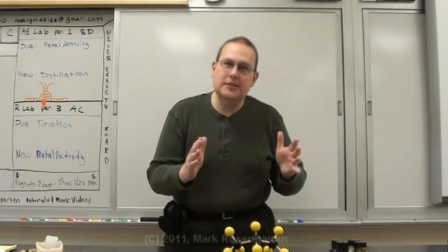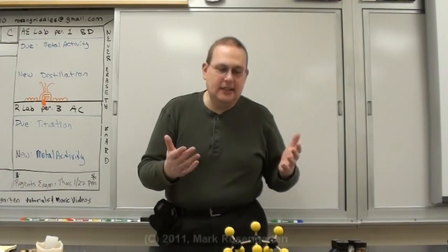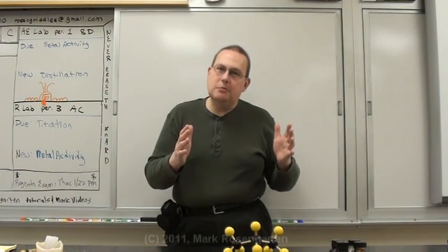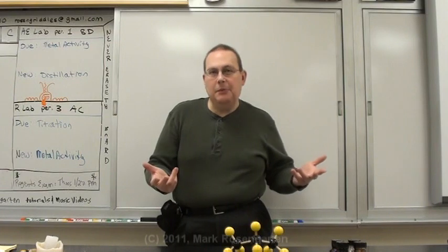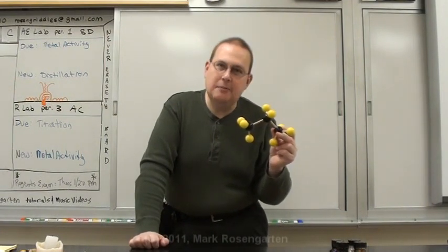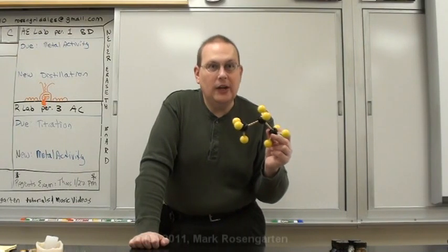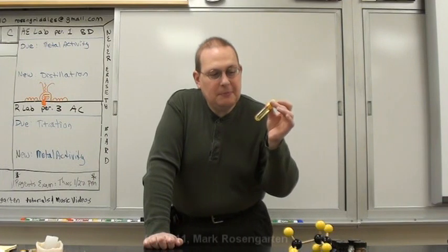The medium-sized ones that are used for such things as jet fuel, home heating oil, diesel, and gasoline, these molecules are going to boil at a much lower temperature, which means you've got to cool them off a little bit more to condense them. And really small molecules like butane and propane, they have really low boiling points. In fact, butane is only a liquid at room temperature if it's kept under pressure.